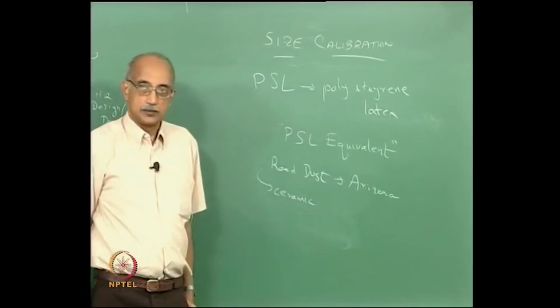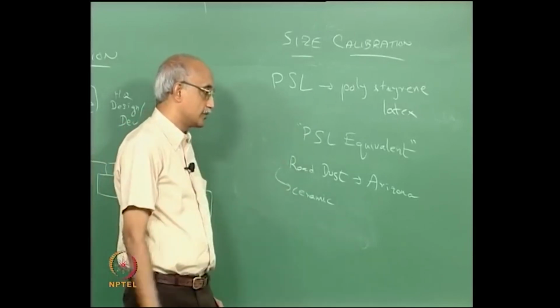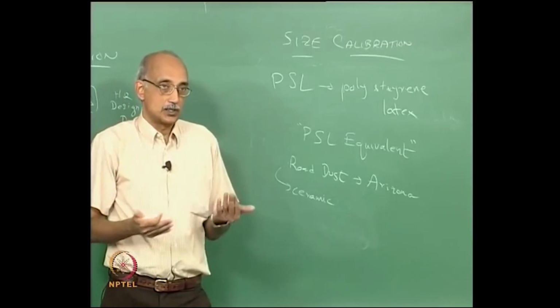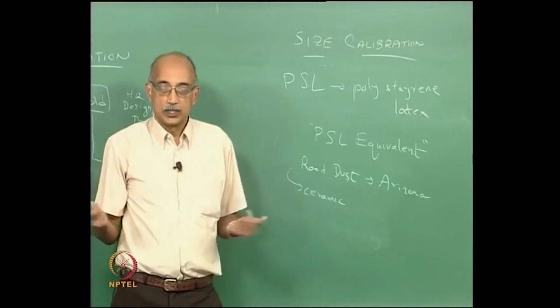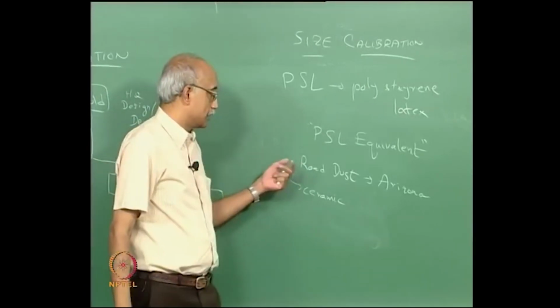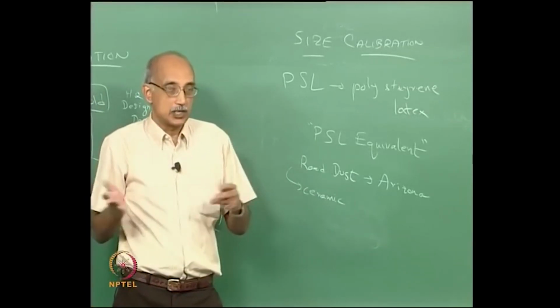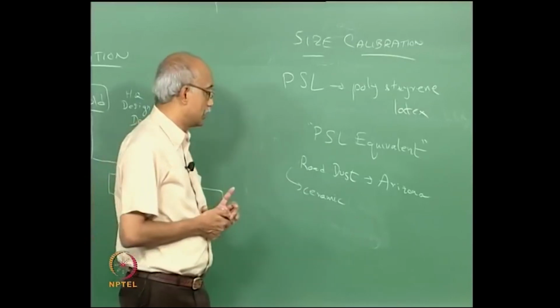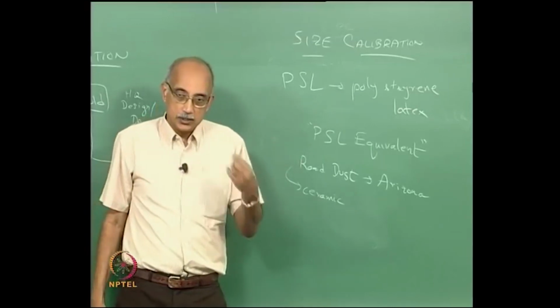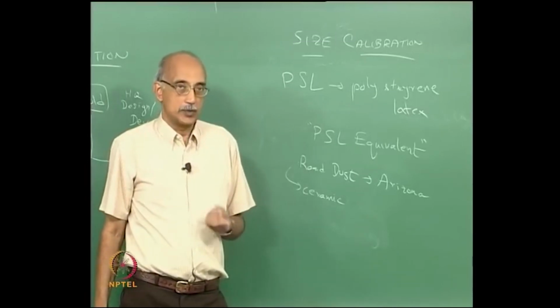as your calibration standard. The difficulty, though, is that it does not satisfy many of the properties of PSL. You cannot, for example, get it in a monodispersed form. Dust by nature is polydispersed, right? So you really cannot do channel by channel calibration using the road dust as your calibration standard. So there are some sacrifices you have to make, but overall the use of a calibration particle that is closer in its optical properties to your actual sample does seem preferable in many cases.